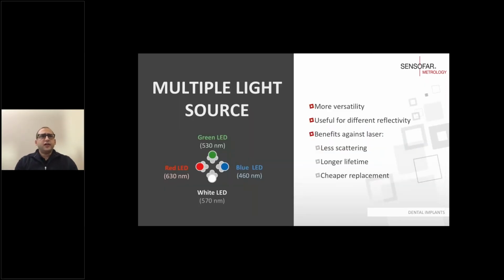So we use LEDs to illuminate our sample. Typically, ISO allows 3 different ways to achieve confocality. You have a spinning disc, which is traditionally used in biology. You also may have seen a laser confocal system where it's a point scanner that rasters across the surface, and that's relatively slower compared to what we use, which is an LED microdisplay.